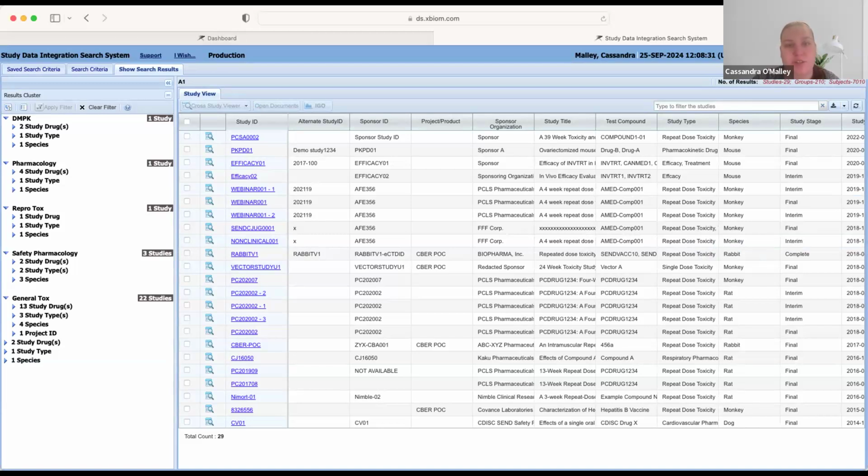To demonstrate the first principle in FAIR, we're going to look at the term findable. In this case, all of our data is permanently attached to this repository. Each piece that we're looking at is going to be individually assigned a study identifier. So in this case, it's on the left-hand side. The pieces of the information that were fed into the study can be individually identified as well.